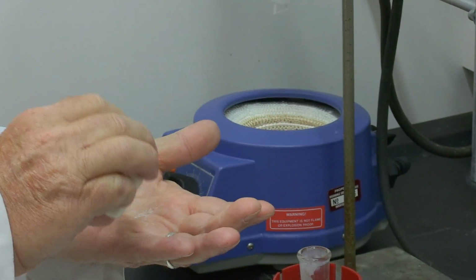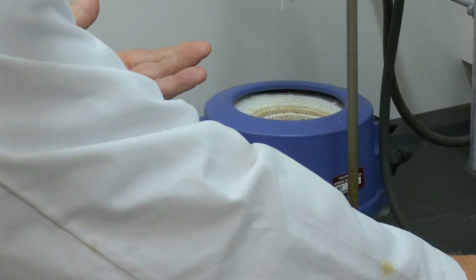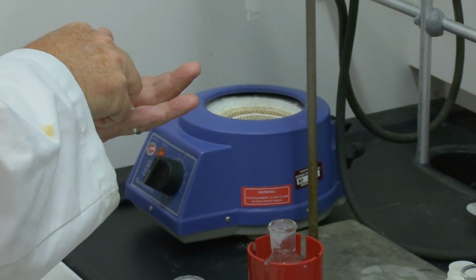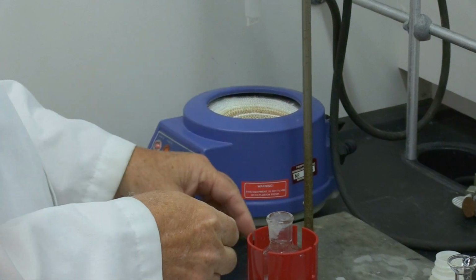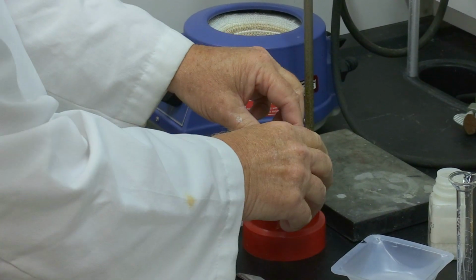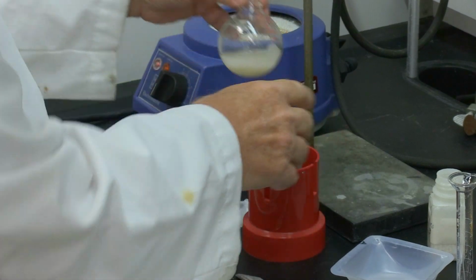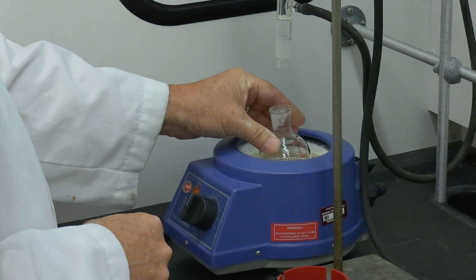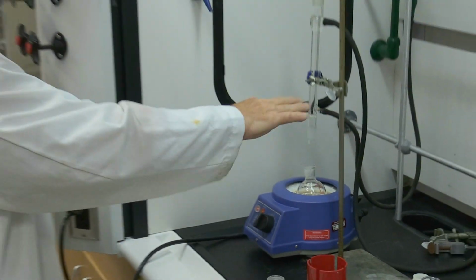You always want to add a couple of boiling chips. Sometimes we weigh these boiling chips in case the weight comes into the end of the process, or we can just pick them out with tweezers at the end. Important to get your water flowing.